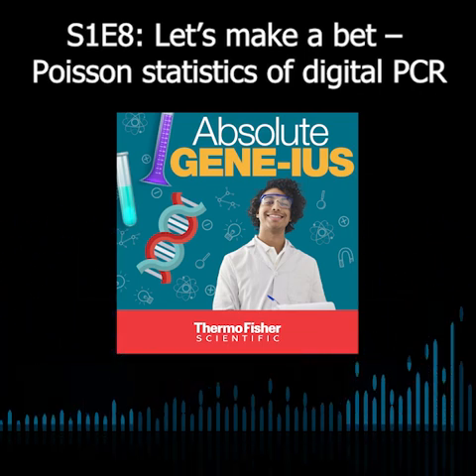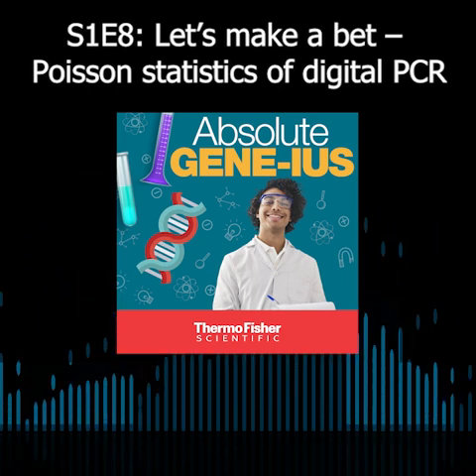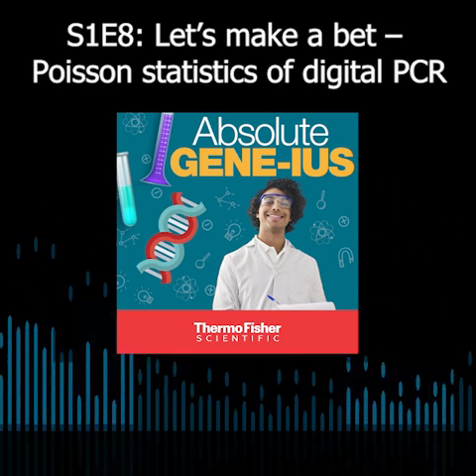How about volume of the reactions? Are there any considerations in terms of what happens if those mini reactions are different volumes? Does that affect the modeling as well?